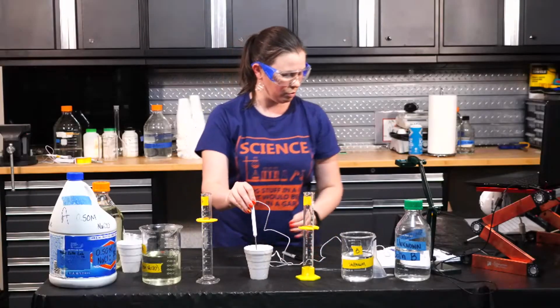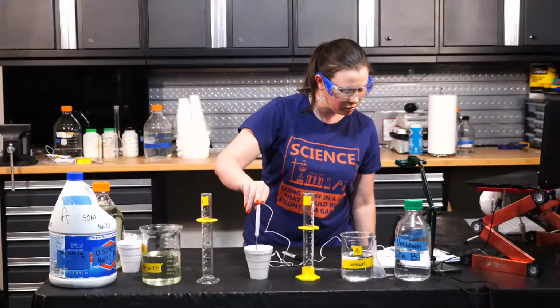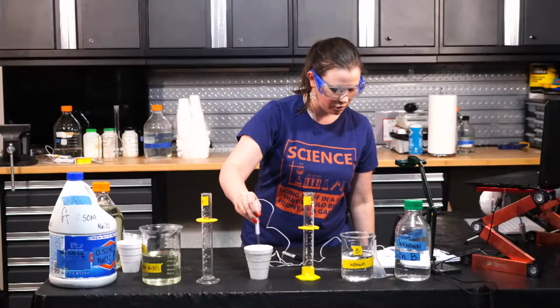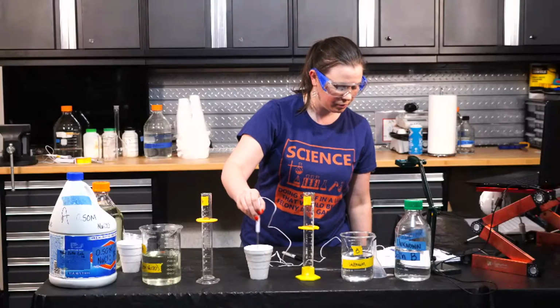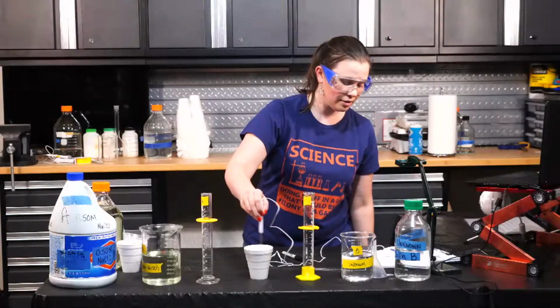And we're up to 24.4, 24.7, 25.0, 25.1, 25.0, 25.1. I'm going to give it a little stir. 25.4, 25.5, 25.5, 25.5, 25.6.